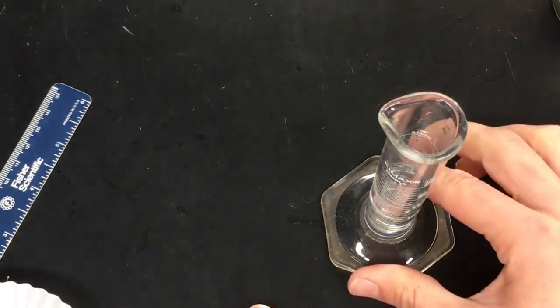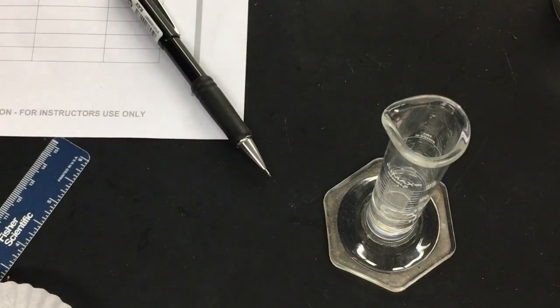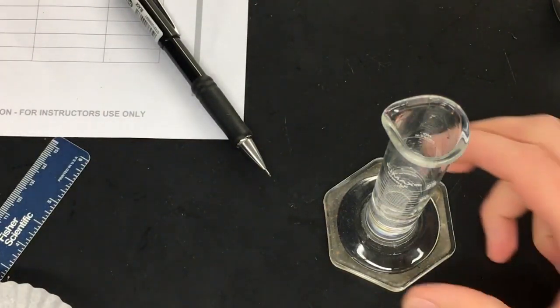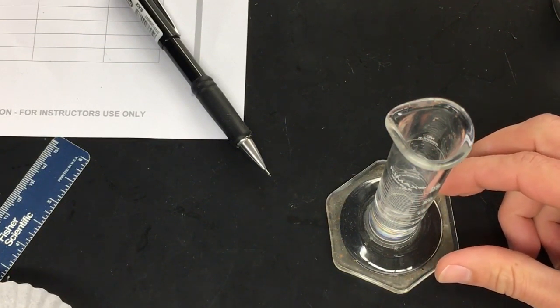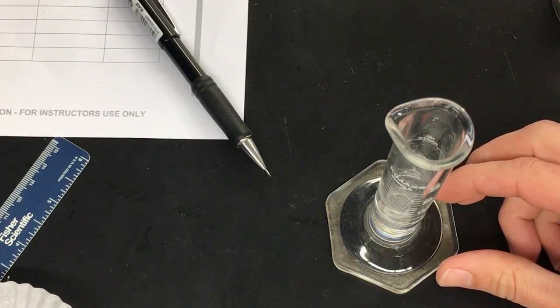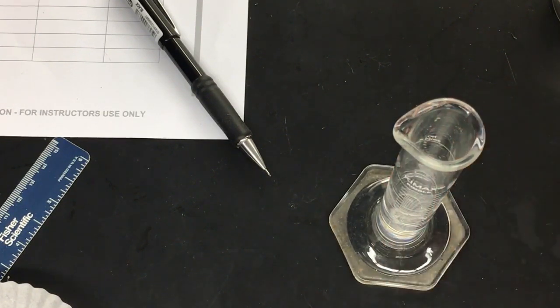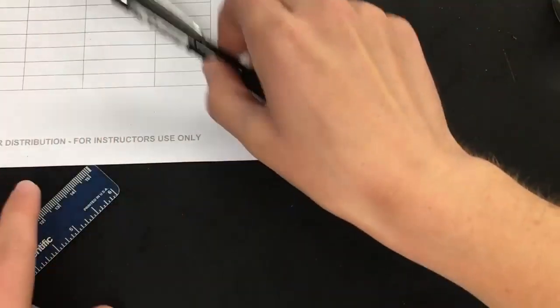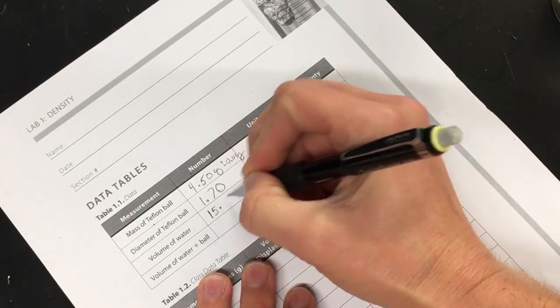And so I'm going to really quickly take the measurement myself, write it down, and then I'm going to try to show you with the camera what I am seeing. So I'm going to say 15 point 15.5, I think. Yeah, I'm going to say my measurement. Now this is the initial volume of the water. So I thought it was 15.5 milliliters.